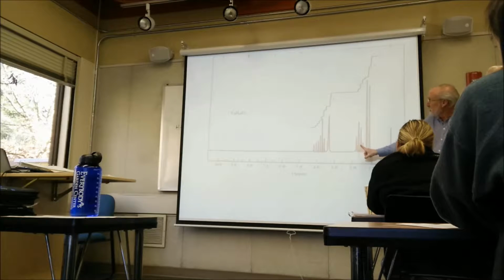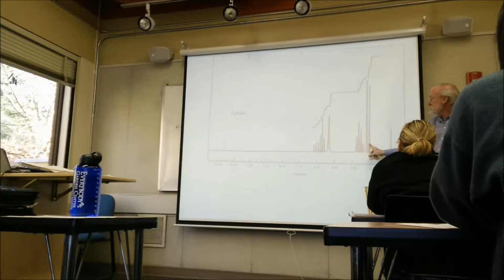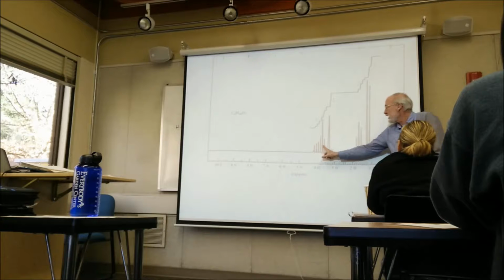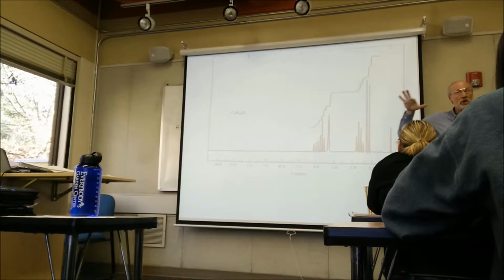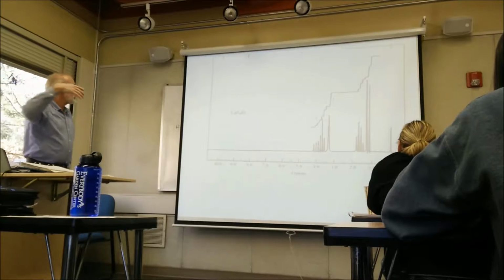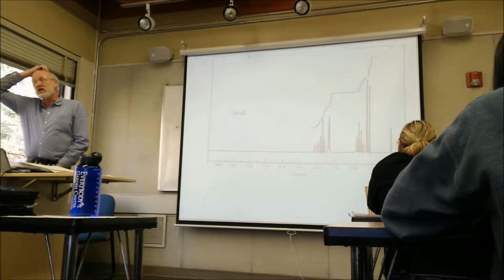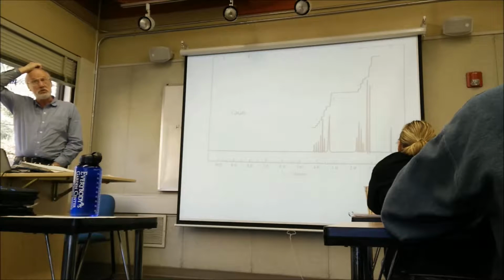Okay, so the upshot is that these 2 things are splitting whatever's under here, and that's why we have a complex multiplet. Okay, so now, how are you going to arrange 4 carbons and 10 hydrogens and 2 oxygens to give you a spectrum like that?